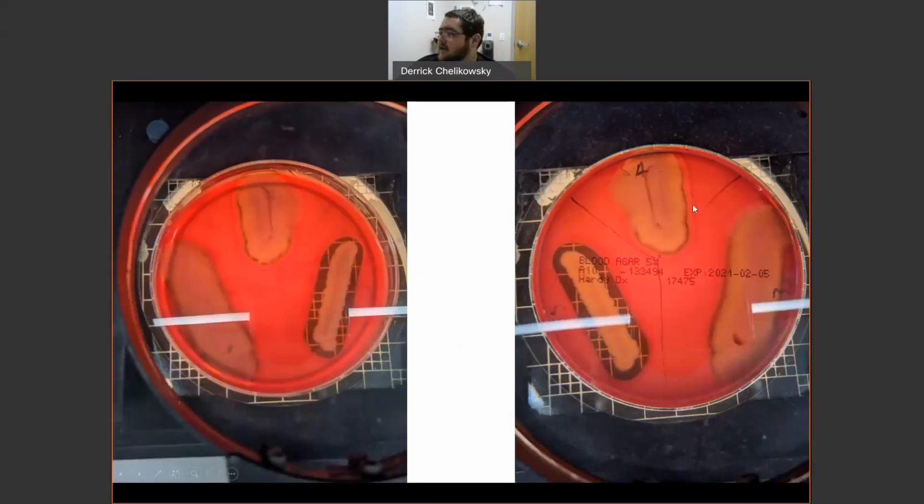So if we take a look, here is the one where you can really see our coding. And as usual, it's mirrored. So this is SS, which is Staphylococcus saprophyticus. This here is Staphylococcus aureus, and this here is Staphylococcus epidermidis. And let me pull up my annotation, because for this you can really see exactly what it is we're looking for in terms of halos.